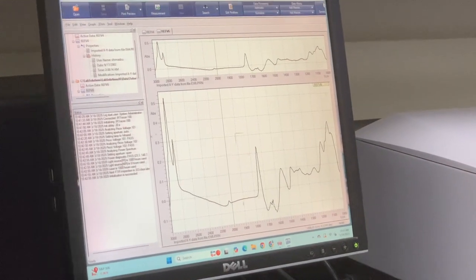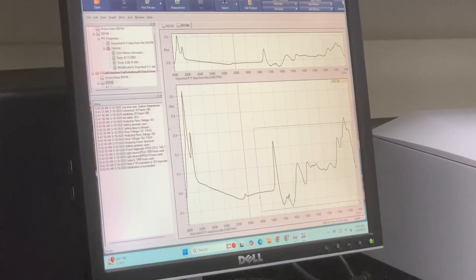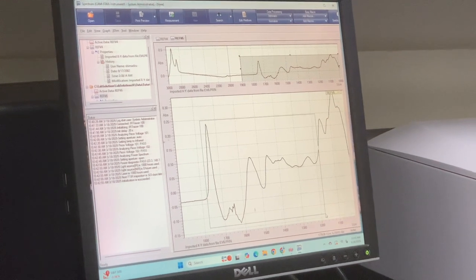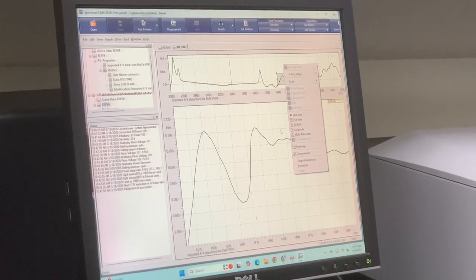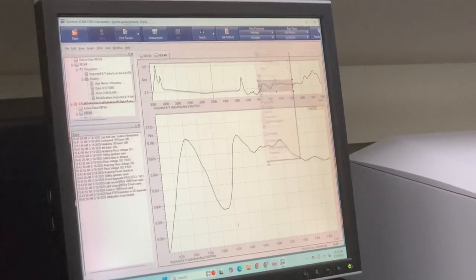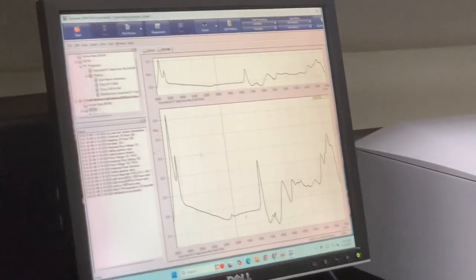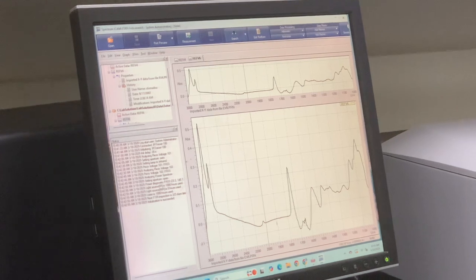I guess if you were doing it step by step, you right click, drag, click again. You say, oh, that section's not enough. Right click, do it again. Oh, I want more, do it again. Now if you right click and do last view, it'll zoom out just enough. So you can kind of control how you're zooming.